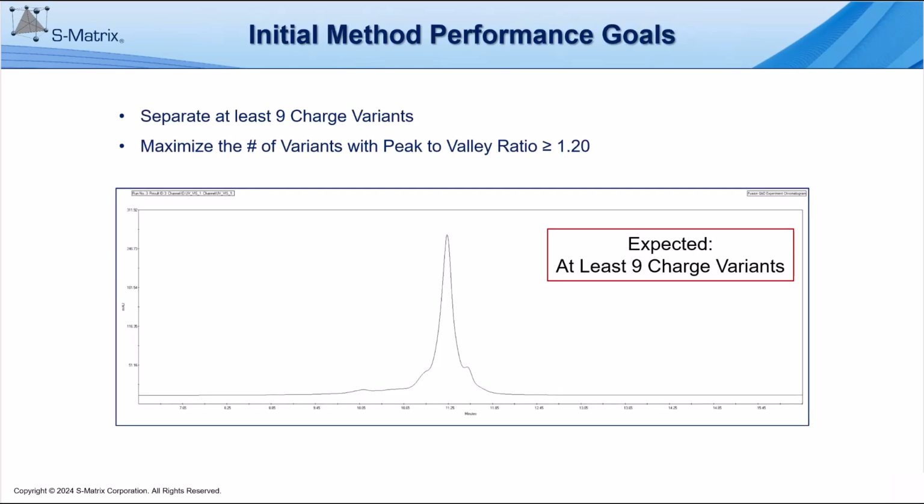Once the experiment is run and basic chromatogram processing is complete, we need to consider which results to import at the screening stage. In this example, we will investigate the number of visualized peaks in each chromatogram and also the peak-to-valley ratios of those peaks as an initial shape parameter.